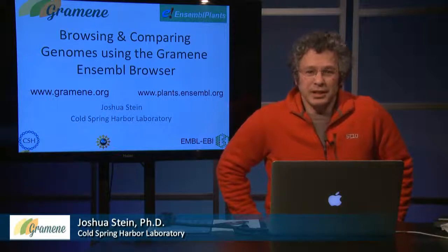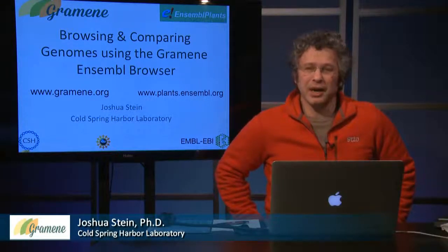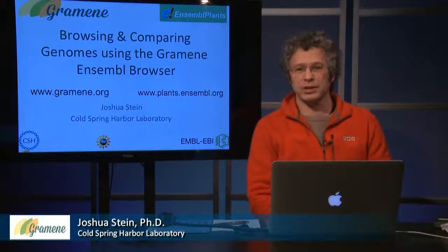My name is Joshua Stein and I will be telling you today about the Gramene Comparative Genomics browser.